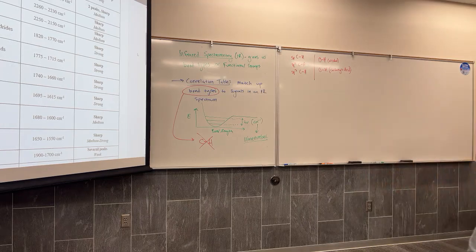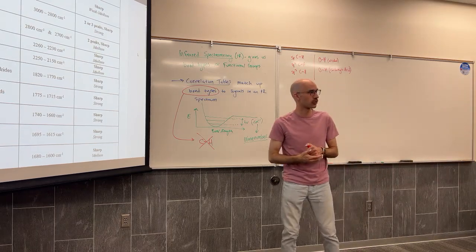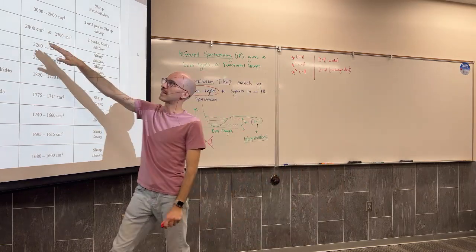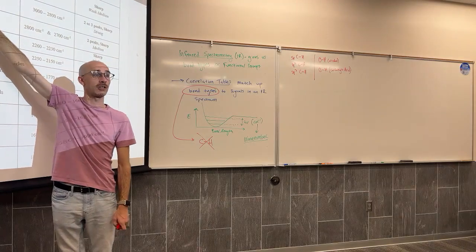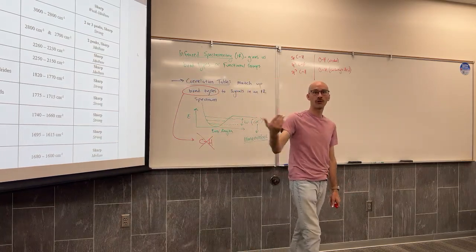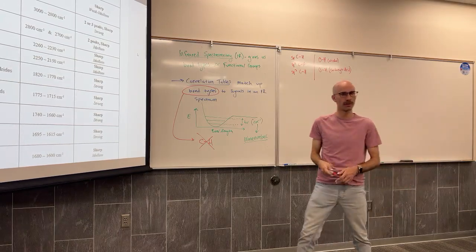I also want to point out something about the sp3 CH. We said that the alkane functional group is carbon-carbon single bonds with only hydrogens attached. You'll notice here that I am not calling it sp3 CH alkane. That's because an sp3 hybridized alcohol might also have an sp3 CH bond. It's technically not an alkane carbon, it's an alcohol carbon.